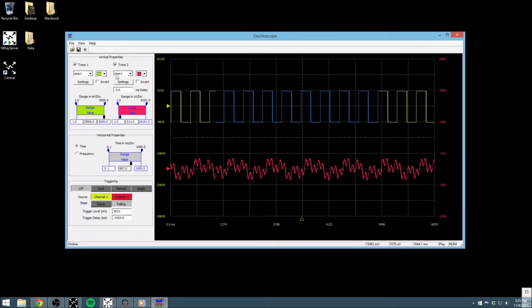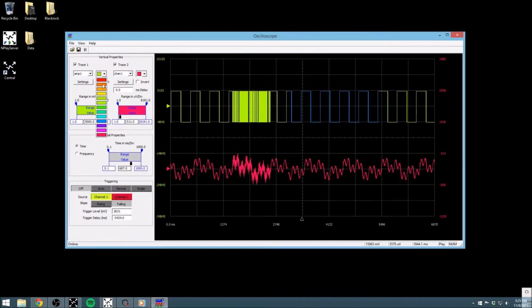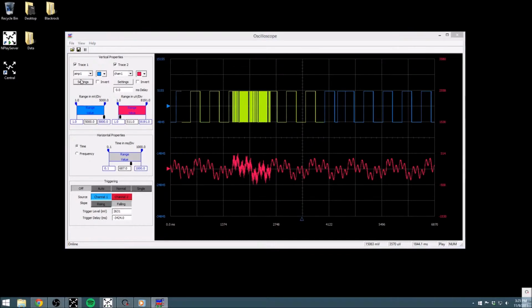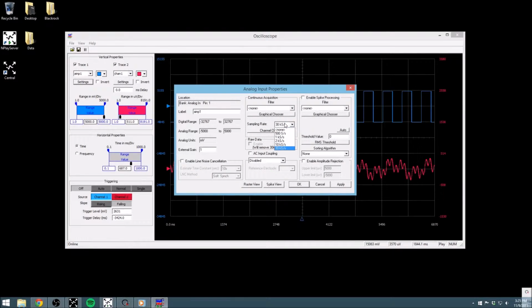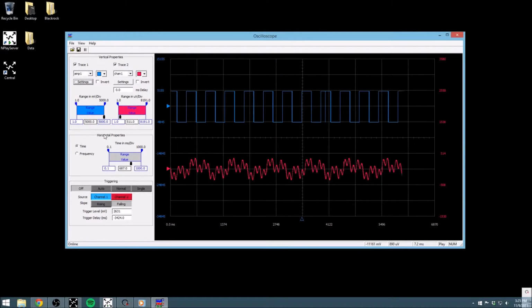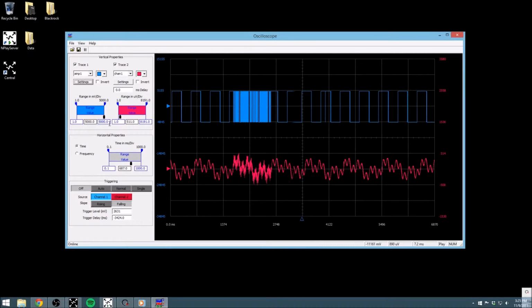The color of the trace for that channel can be selected in the exact same way. The Settings button here will simply open the channel properties for that channel. It is important to note that some sort of continuous sampling must be enabled for the oscilloscope to display a trace. The oscilloscope will display whatever the selected continuous data is for that channel, including any applied filters.